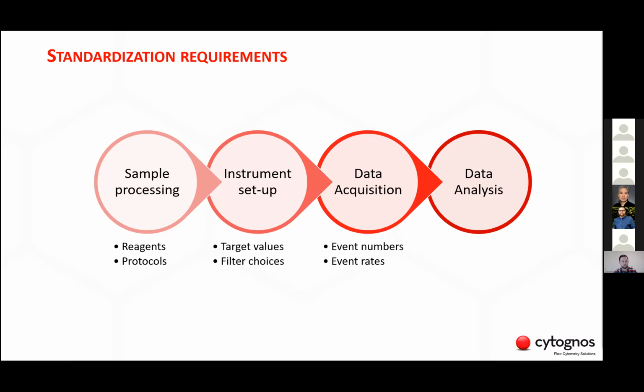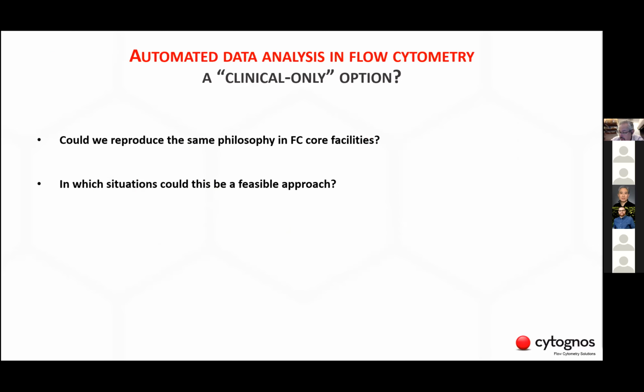So this level of standardization is common and accepted in a clinical setting, but the question that I would like to leave to discussion, and that's why I said more than trying to explain what we do well or not well, is to open the debate on whether this kind of approach, this kind of standardization and the use of reference databases of reference samples to do an automated analysis could be applied in core facilities to be employed in basic research.